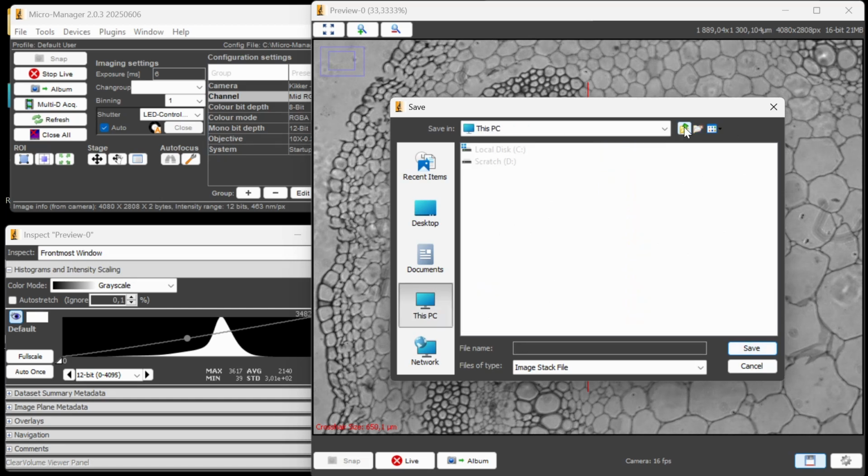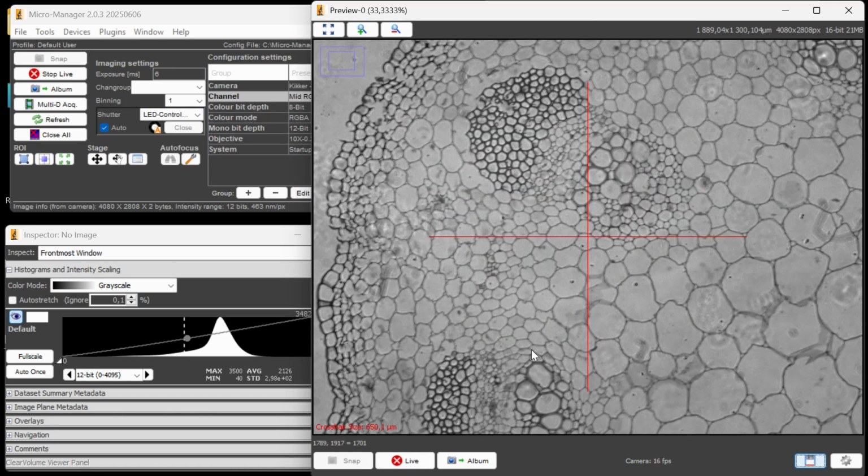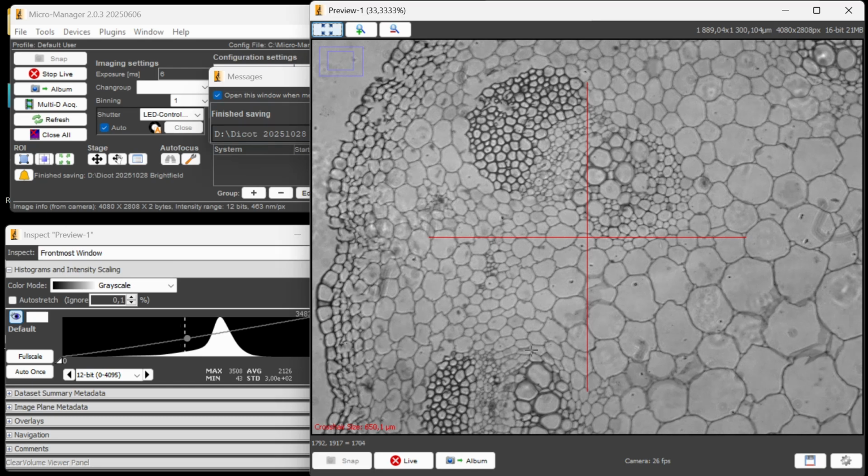To capture your image, you can click Save on the lower right corner of the live display window to save the current field of view directly. Save your image using an appropriate file format, such as TIFF. Your sample name should include information about your sample, the date it was taken, as well as information as to the imaging modality. All metadata, including exposure time, illumination mode, objective lens, and other user-defined notes, are embedded within the TIFF. Always maintain at least 2 independent copies of critical data sets, and check your institution's data management policy to ensure compliance with storage duration, privacy, and sharing requirements.